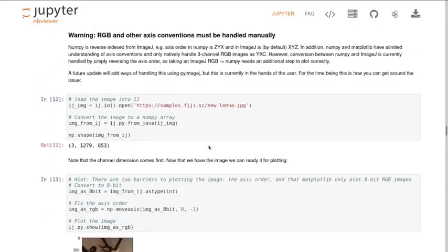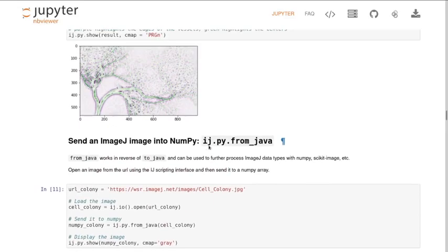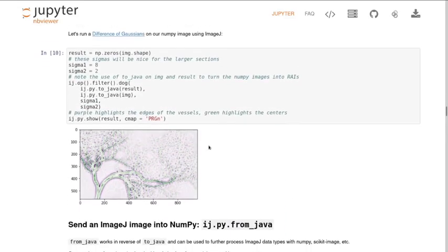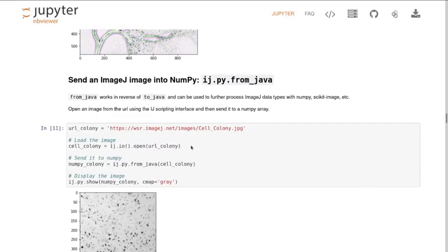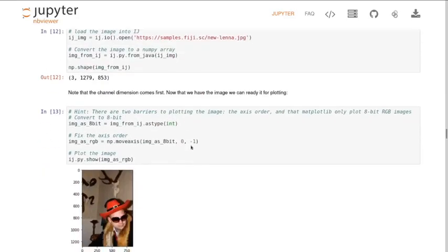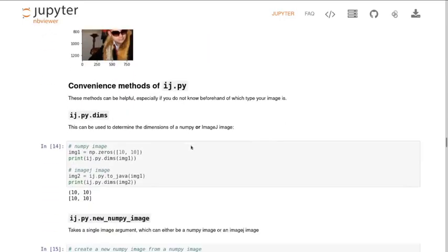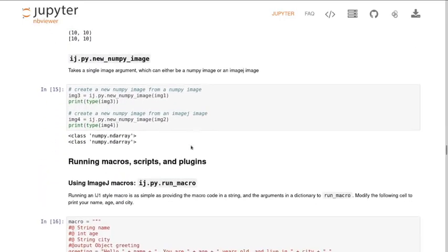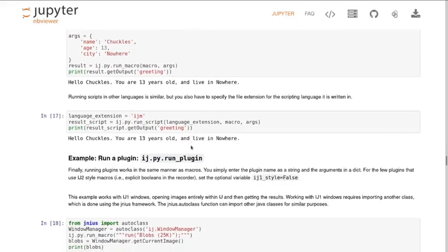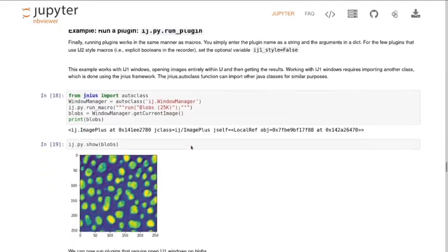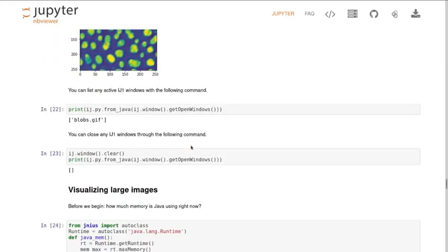But even if you write them in Groovy or the ImageJ macro language, this idea of this hierarchical ideal of accessing the ops section first and then in this case the health function, or I think there's another op, accessing the ops section first and then the transform section and then the function you're actually interested in below should be fairly familiar.